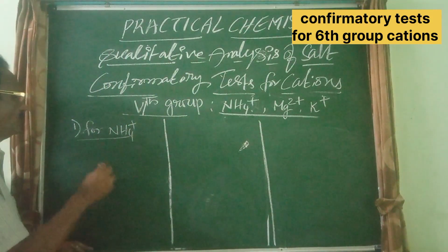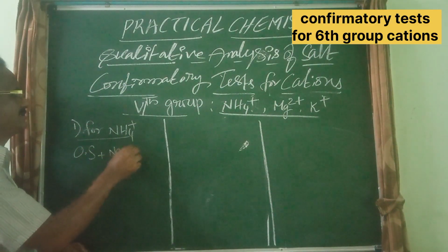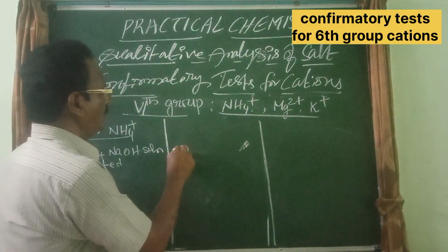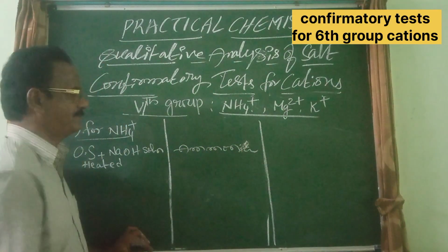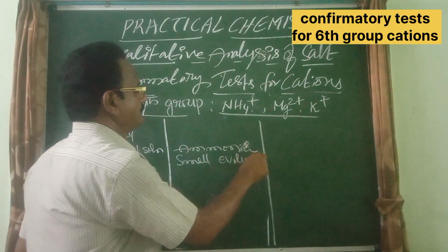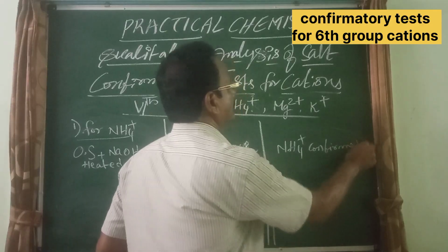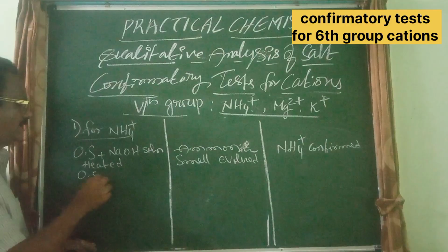For NH4+, the original solution is added with NaOH solution and then heated. If an ammonia smell evolves, then the presence of NH4+ is confirmed. This is test 1.